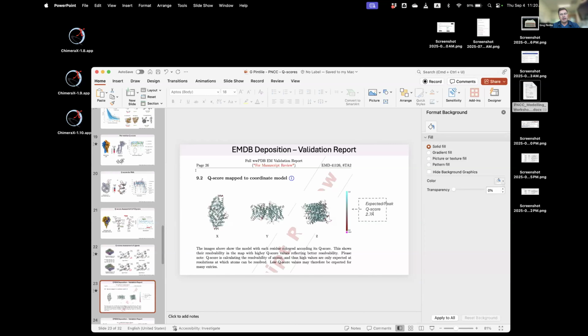Are your dihedral angles falling in the expected ranges that have been plotted before? Once you start to refine against the dihedral angles, you start to strain your models to try to fit these. And the way a protein model works, you might strain other things. You might get higher clash scores and worse bonds. It really was just a validation method to see if you've done the refinement well. And when you start to refine against that metric, it becomes less useful as a validation metric.